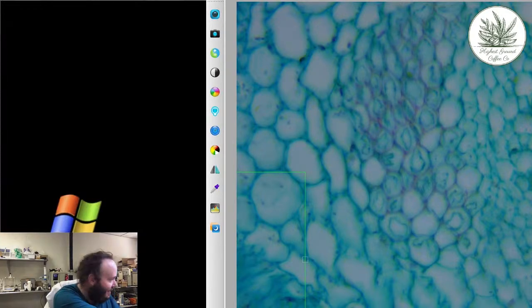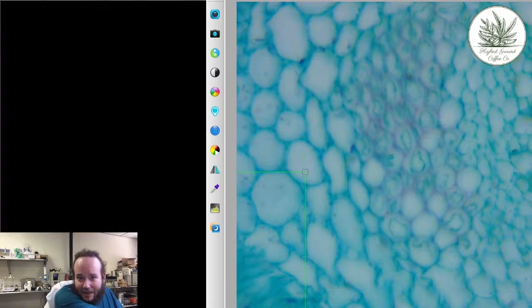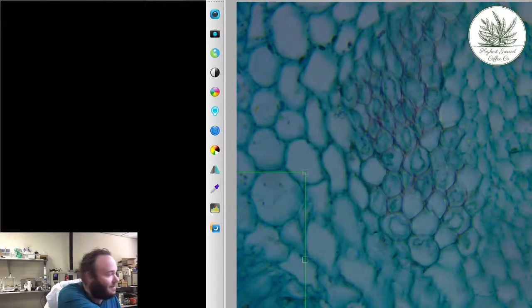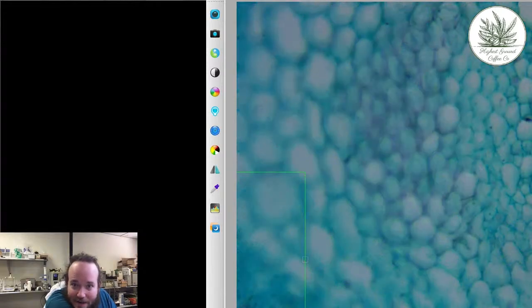Yeah, that's neat. I'm going to fuss around with the objective lighting here, see if we can get more contrast and detail. How cool is that?